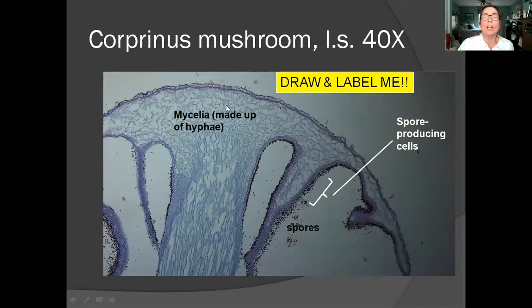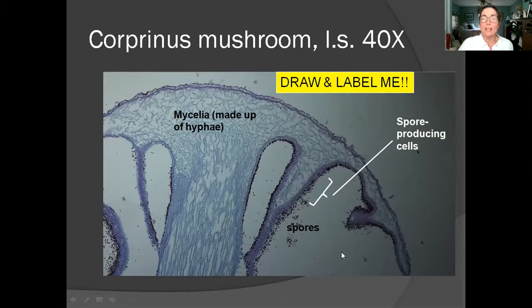Those are the hyphae all up in here. On the underside of the cap you see those spore-producing cells — these little long skinny regions — and you can see some of the spores being released. Pause here for a few minutes and draw what you see and label as you see it.